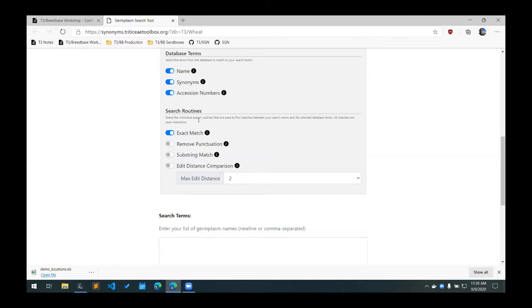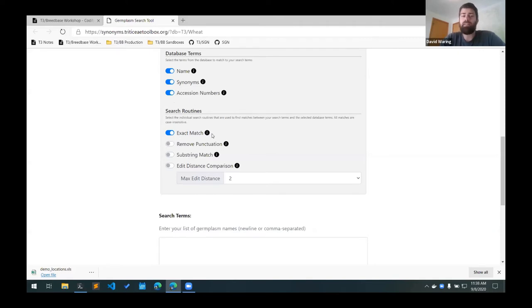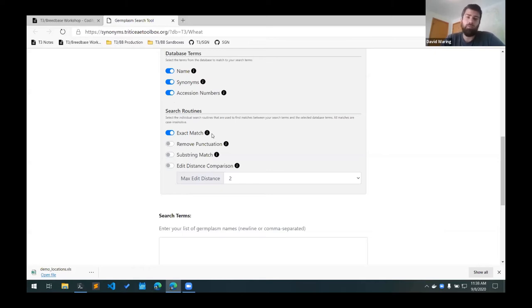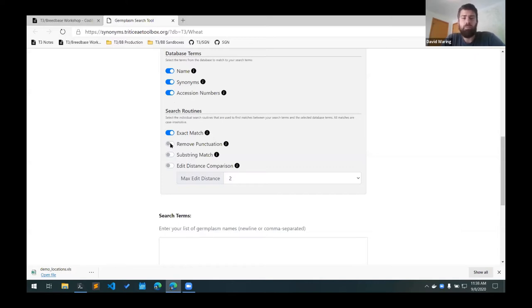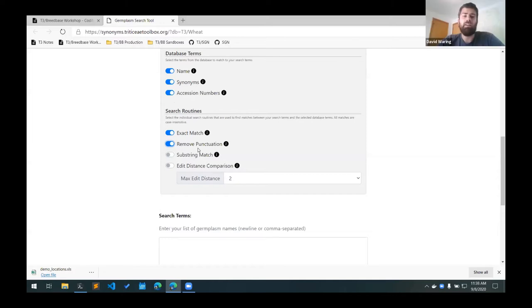And then it has a number of different search routines that you can use. An exact match will just match if the names are exactly the same. All of these are case insensitive, so it will still match if there's variation in letter case. There's a remove punctuation search routine that will remove any special characters such as dashes, spaces, or underscores, and try to match that up with one of the database terms.